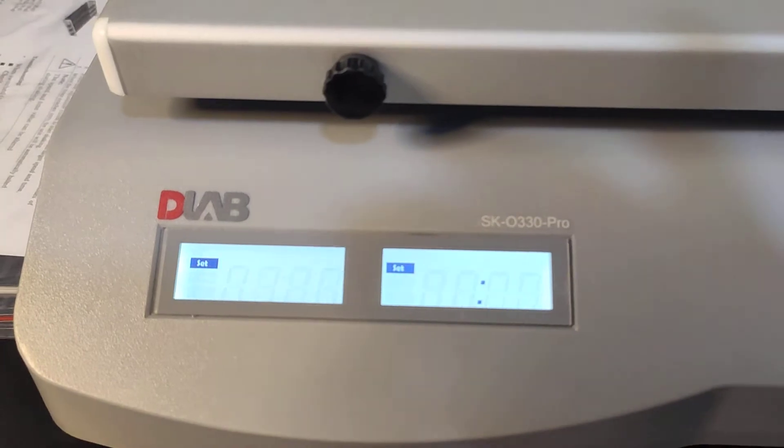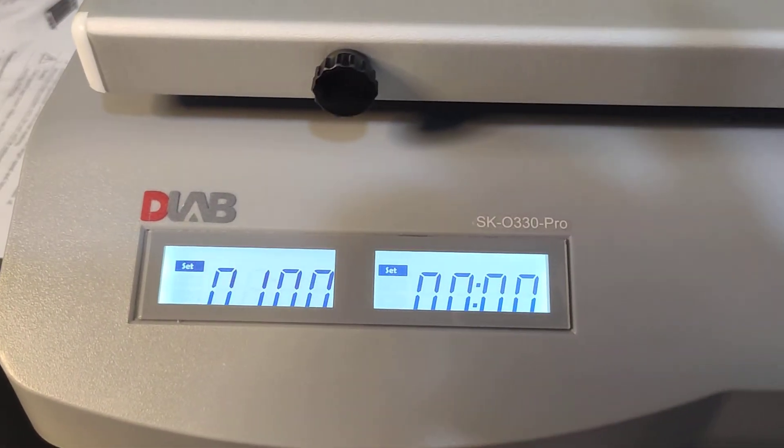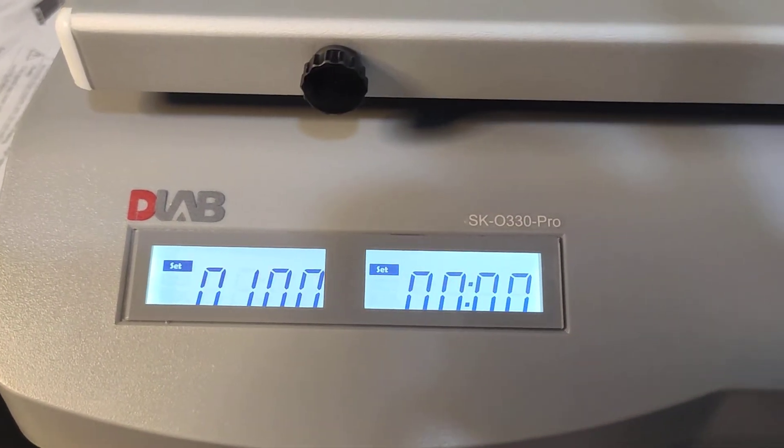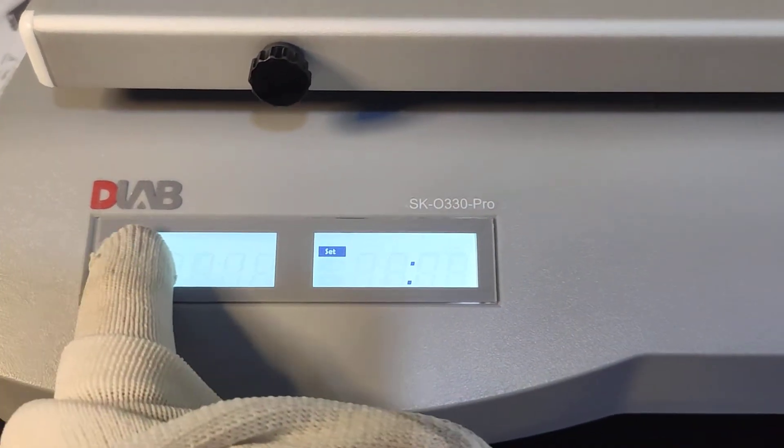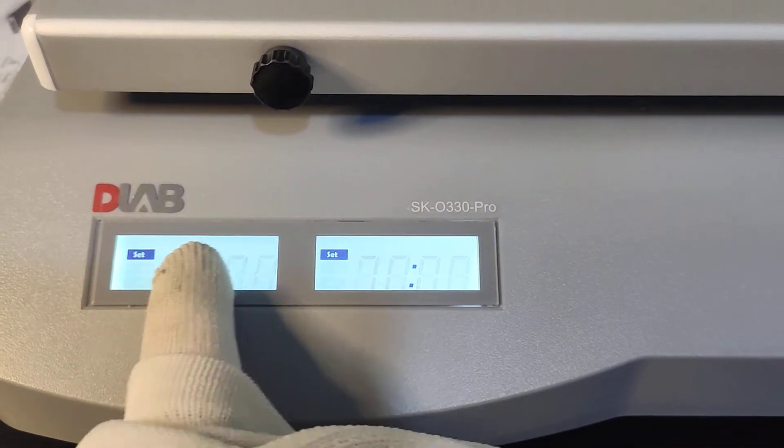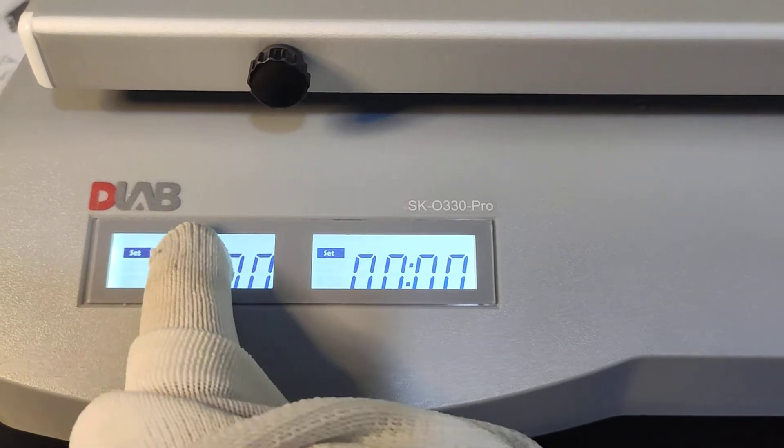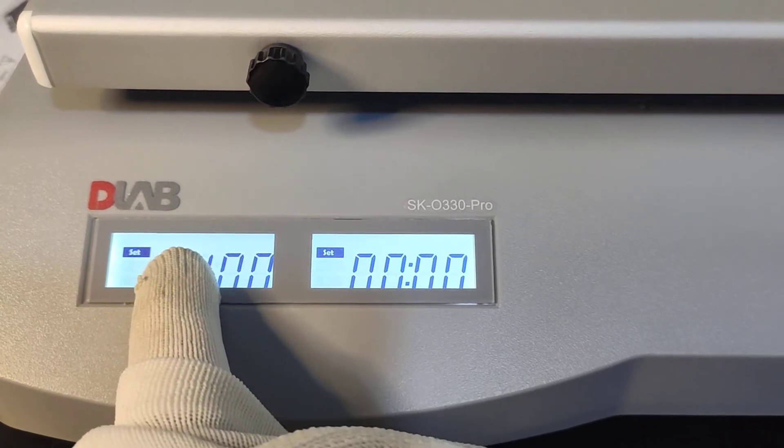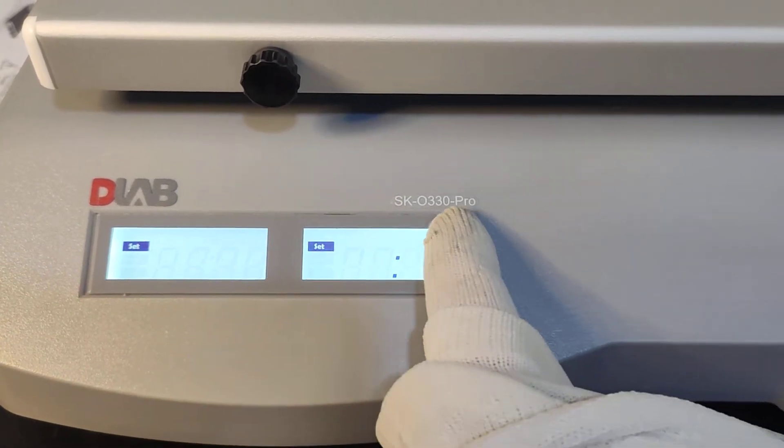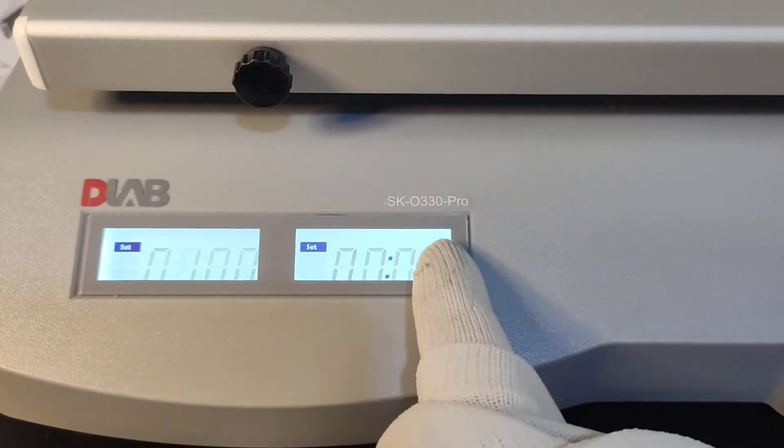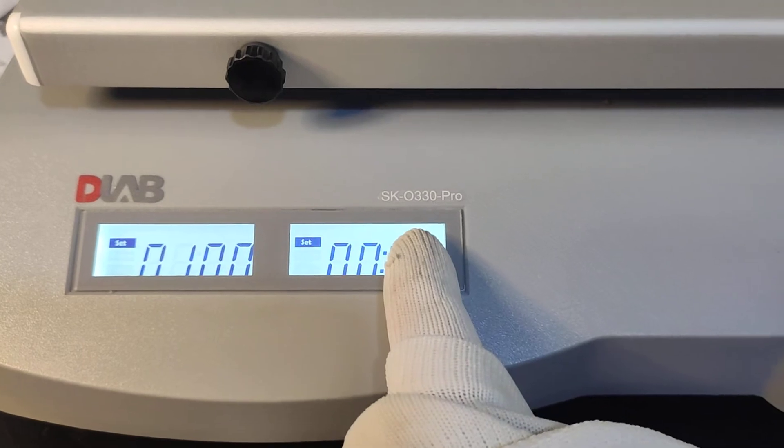And we can see the screen. There's two sides. One, this side is for the shaking speed and this side is the timer.